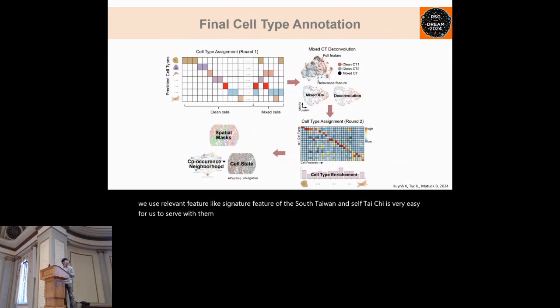So at the end, we're gonna have the final cell types based on that, with the matrix representing the cell type on the row, and then the column gonna be the marker.